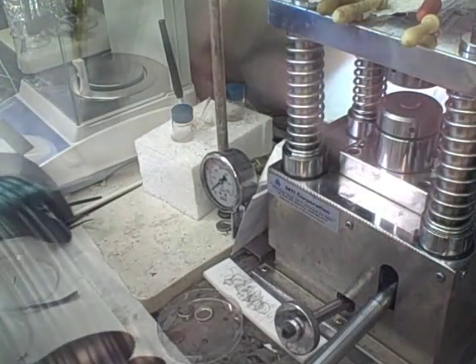The button cell can now be tested using MACCOR, which monitors relevant data such as cycle capacities and voltage curves.